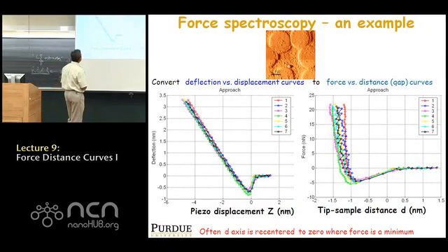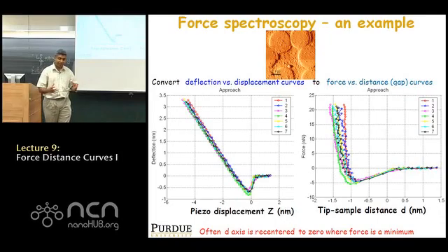This is a real example, on a carbon fiber composite. What you see is a cross section, about a 10 micron by 10 micron image. The circular topography features you see in the atomic force microscopy image are carbon fibers. Each one is about 3 microns in diameter, and the area in between is a polymer, an epoxy. This is the kind of carbon fiber you might get in aircraft applications. In fact, it's connected to a project we have with Boeing.